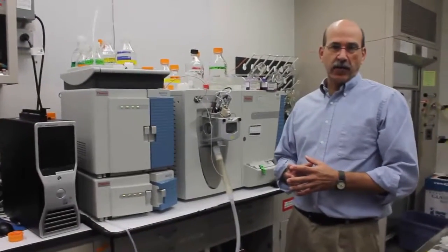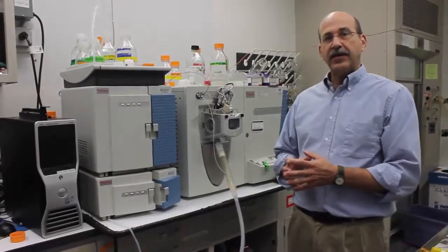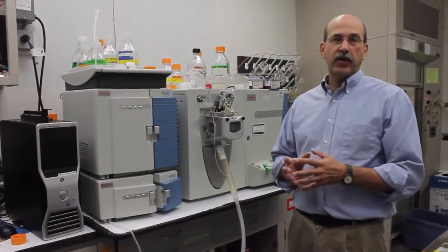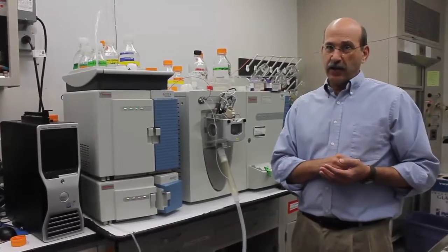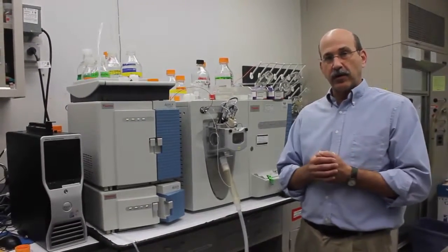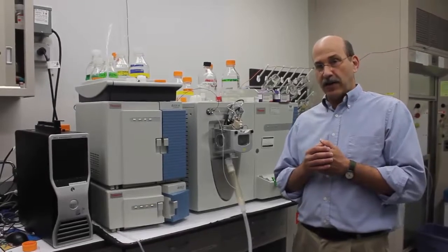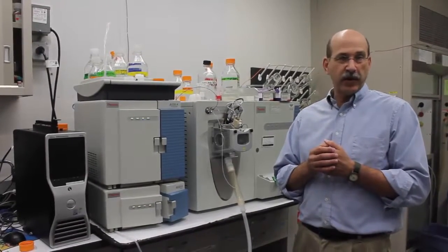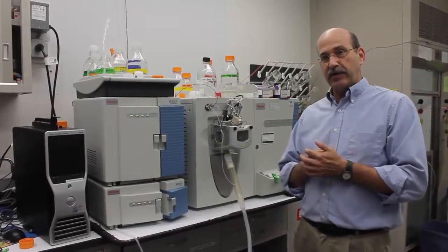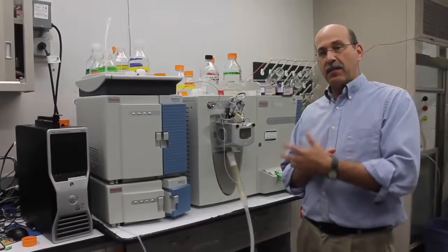Previously, I told you about gas chromatography mass spectrometry, which is a way we can separate compounds, analyze them, and determine unknowns. But primarily, those are organic compounds. And when I say organic, I mean carbon, hydrogen, oxygen, nitrogen-containing compounds. But they have to be semi-volatile or volatile, which means they have to boil somewhere between 0 and 300 degrees Celsius. If a compound is non-volatile, or if it's polar and doesn't boil in that range, we use a different process, which is separation by liquid chromatography, and detection again by mass spectrometry.